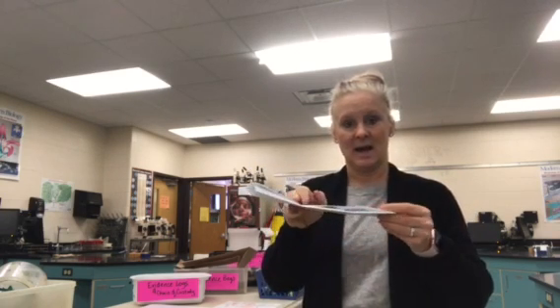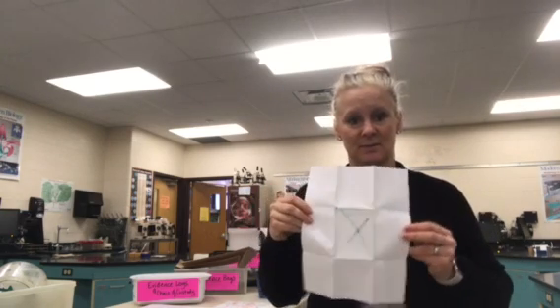So what you're going to do is you're going to take one of those pieces of paper and you're going to fold it into thirds like this, hot dog style, so lengthwise. Now, I've pre-folded this one, so I'm making it look pretty easy. Then you're going to fold it burrito style into thirds. When you open it up, once you've got your creases in it, you should end up with basically 9 squares.